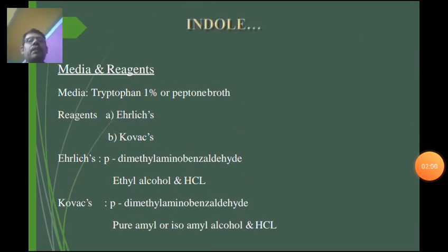The media and reagent for this process: tryptophan 1% or peptone broth. Basically, tryptophan is an amino acid, and peptone broth is a protein, that means amino acids. For the growth of the bacteria, amino acids are needed.